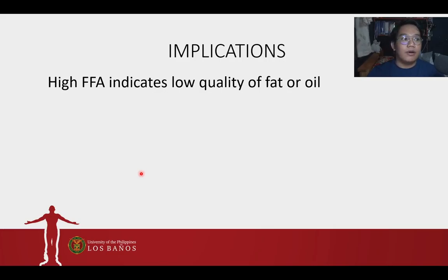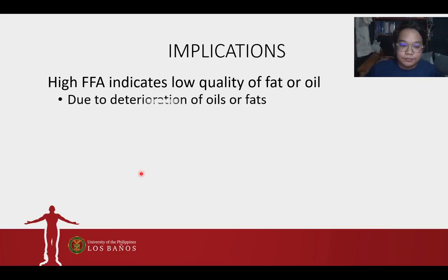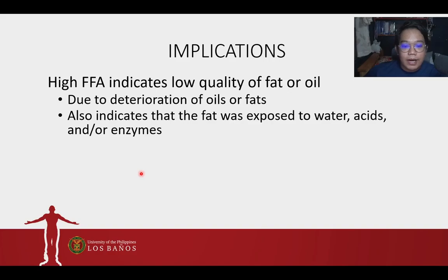Hindi pa nagkakaroon ng hydrolysis yung ating oil in such a way that your water will interact with the triacylglycerol, forming your glycerol and your free fatty acid. So, basically, if mataas yung free fatty acid natin, mababa na yung quality ng ating oil. So, mababa yung ating quality due to the deterioration of oils.